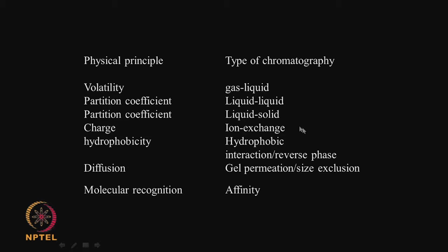Same thing if you look at liquid solid chromatograph, again partition coefficient comes into picture. If you look at ion exchange chromatograph, charge on the molecules, could be a biomolecule or it could be a protein. So, the charge determines the separation process. If you look at hydrophobic interaction chromatograph, the hydrophobicity, as you know, different proteins will have different extent of hydrophobicity, and this particular chromatograph makes use of that principle for separating out proteins. This is also called reverse phase chromatograph or interaction chromatograph.